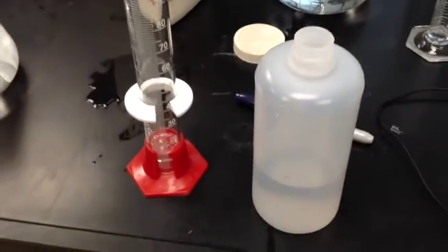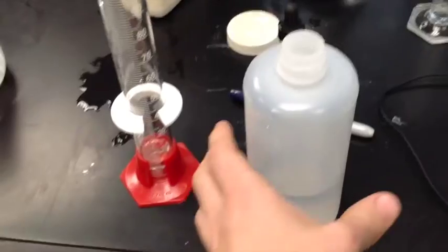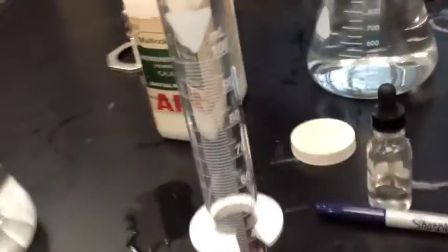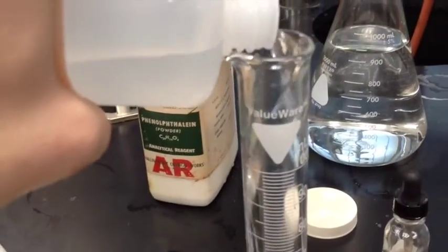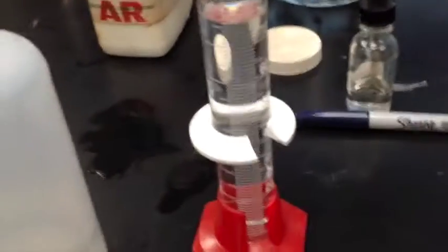So let's say you're working with some acid here. This is just 1 molar HCl. And you've got some 1 molar HCl here. Let's try to measure that volume really fast. Oh, I'm klutzy. Oh, God, I'm adding water. Oh, that's a mistake. Oh, I have no idea what that is.